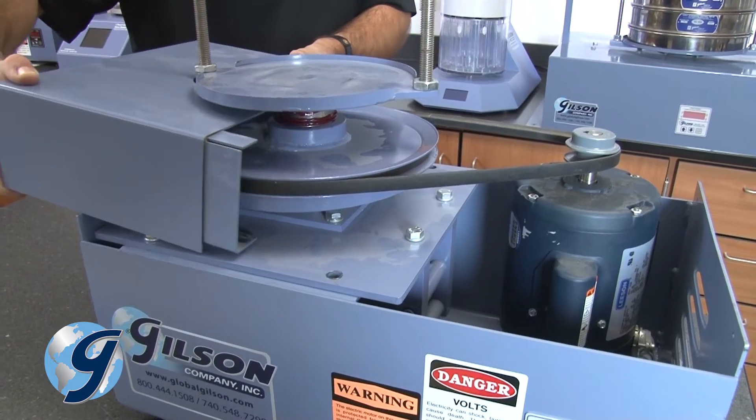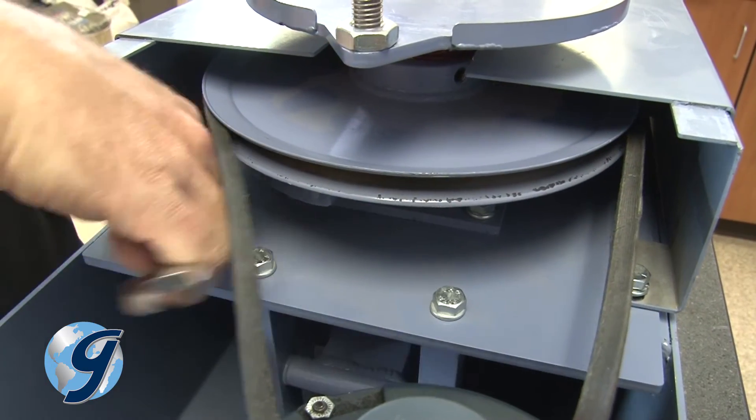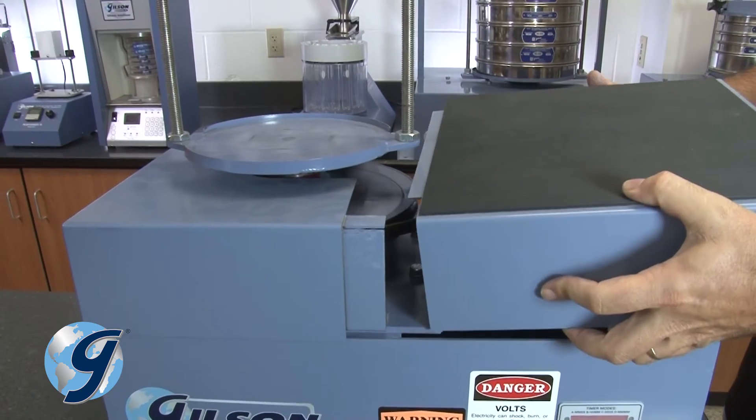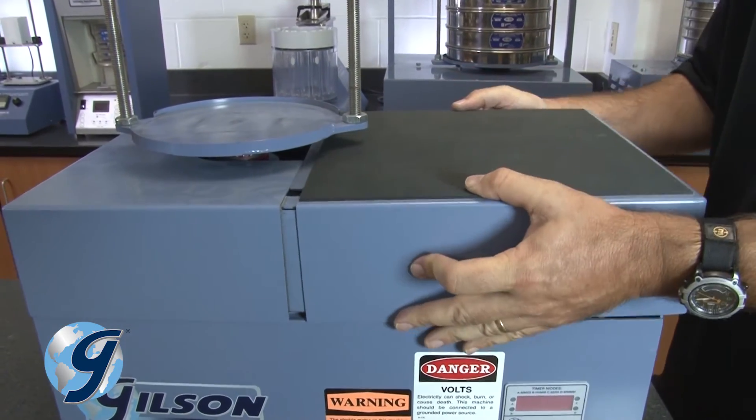Return the left case cover and reinsert the two hex nut screws on the cover flange. Next, return the right case cover section and tighten the four cover mounting screws.